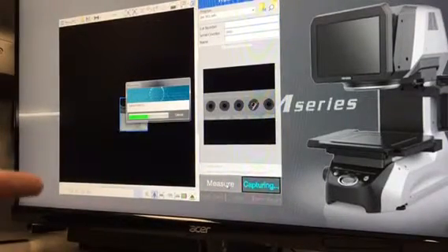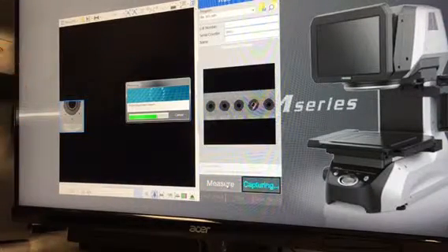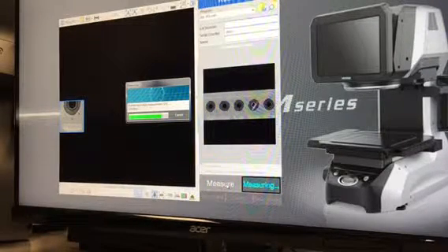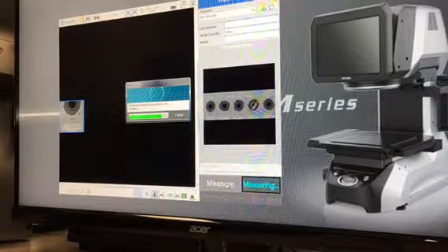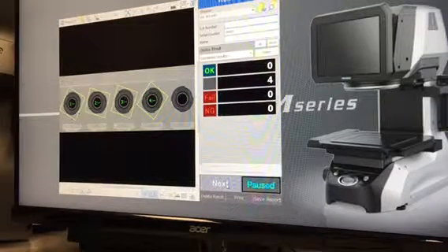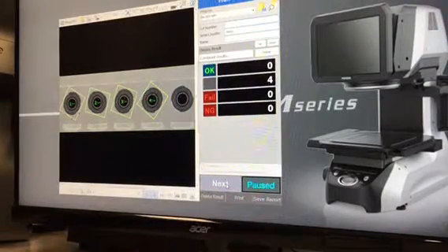But every time you click measure, will it measure 4, or if you go to the main menu and then go back in, it'll go back to 1? Okay. So it's measuring right now. Let's say then I put the next set. Oh, that's really cool. And then let's say next.